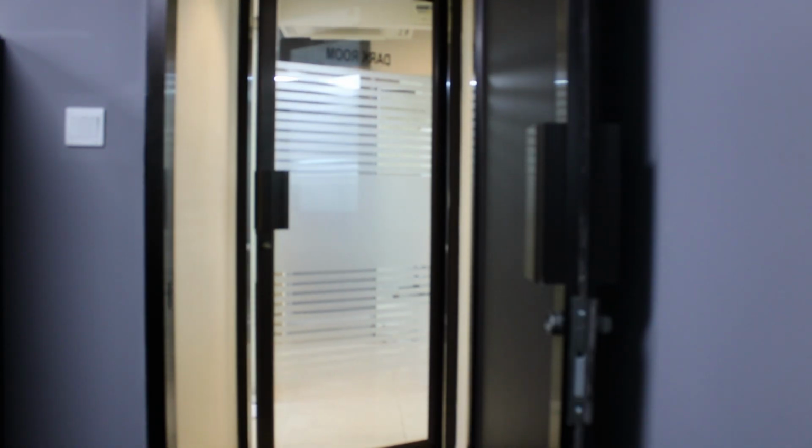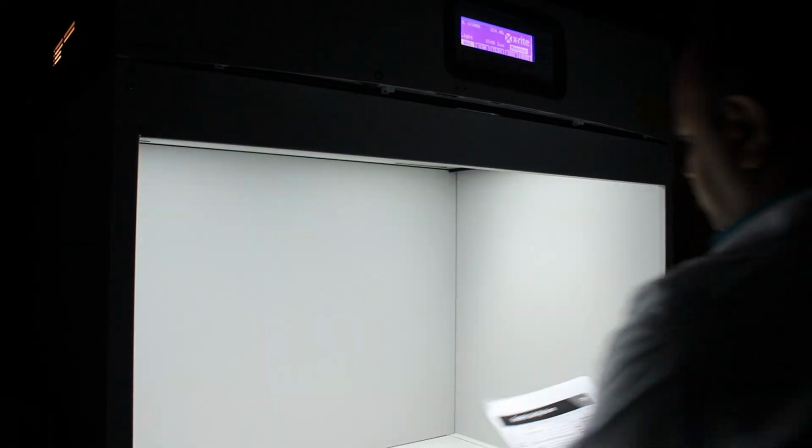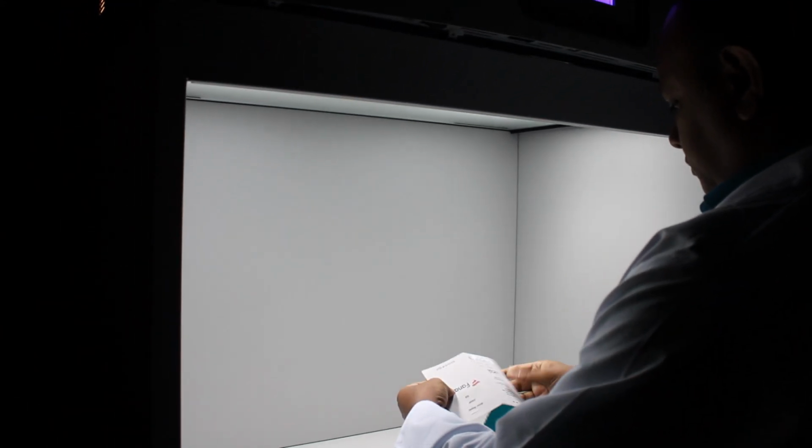Our dark room is kept under the same conditions, housing approved lab dips throughout the season. We approve the lab dip using the latest light box, reviewing through D65, U30, TL84, UVA, CWF, and HZ light sources with data from the spectrophotometer.